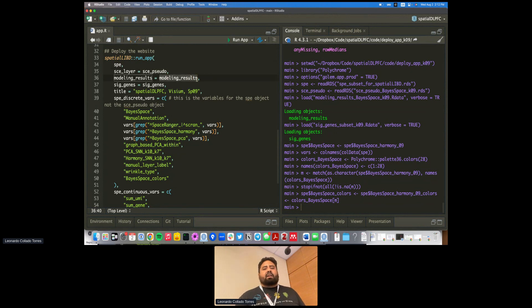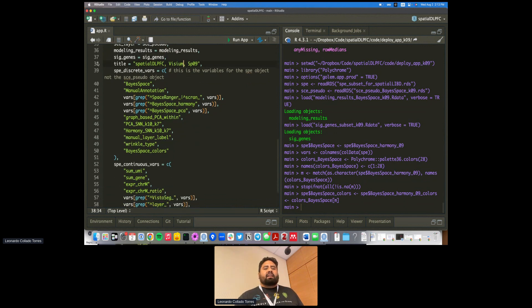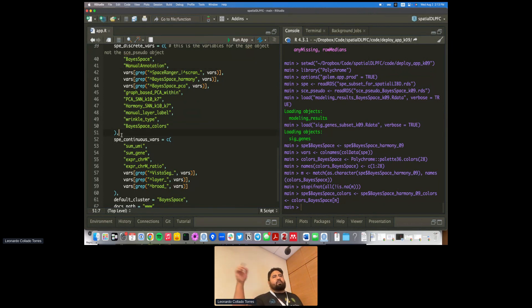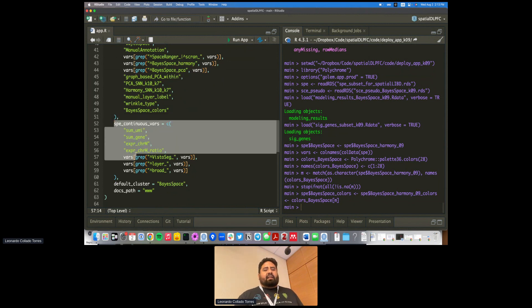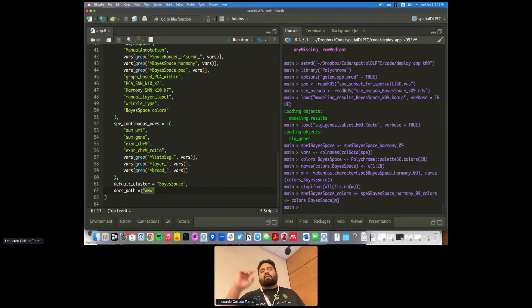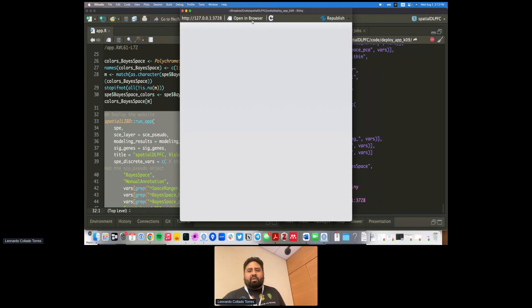I load the modeling results, fix a variable, extract all the variables, and set some colors. Then I use the run_app function, specifying my SpatialExperiment object, my pseudobulk data object, and my differential expression results. From those objects it extracts the list of significant genes. You give it a title for your app, then specify which are your discrete variables — mostly cluster variables — and you can include manual annotation. You can also specify continuous variables and a default cluster, then run it and open in the browser.